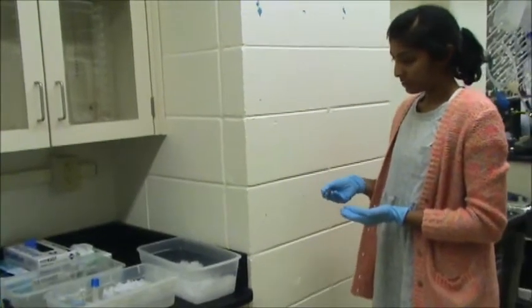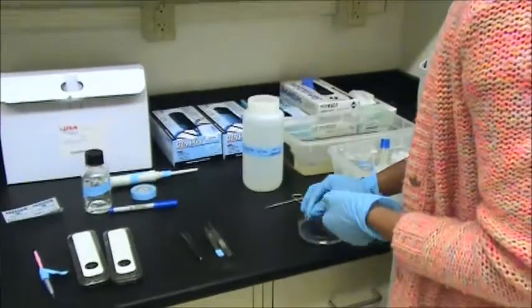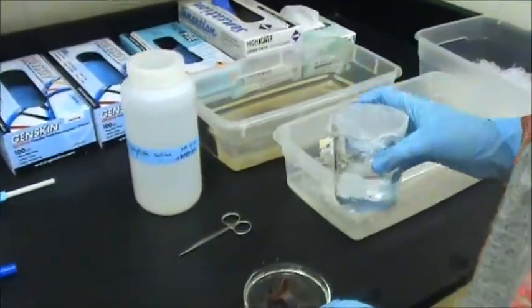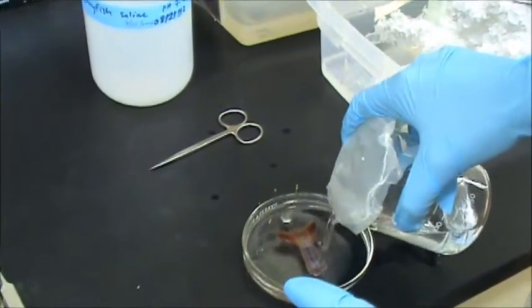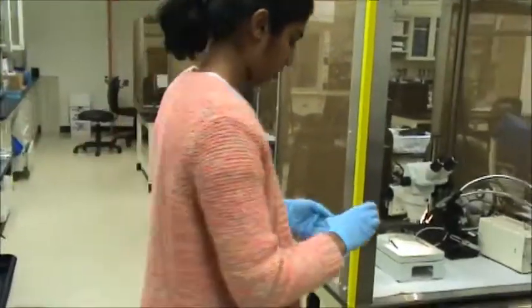So now we're going to take this prep that we've dissected and put it on a Sylgard dish, and we are going to cover it with the saline from before. So now we're going to move it to the microscope.